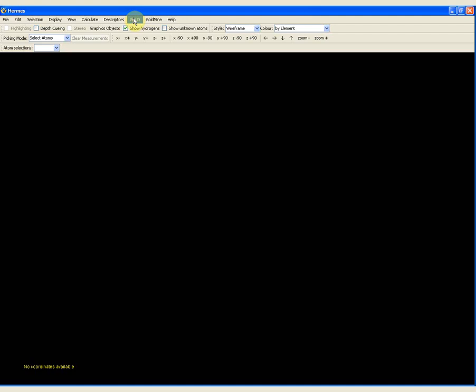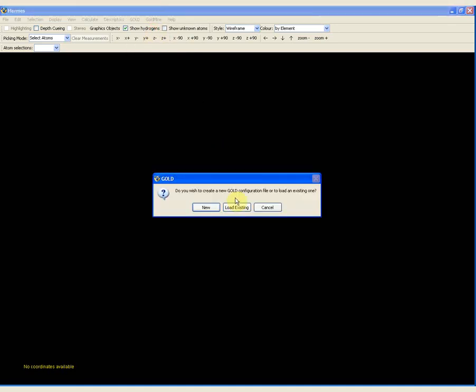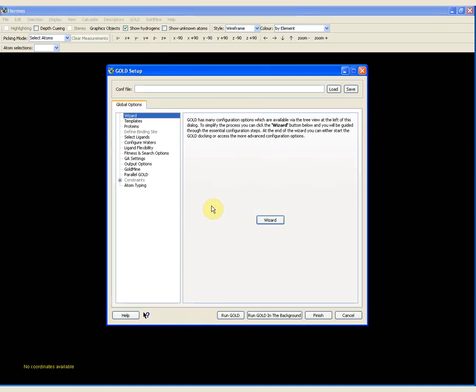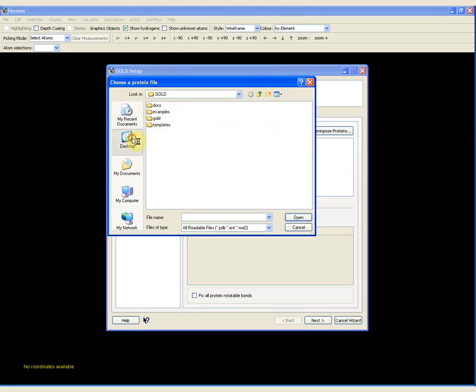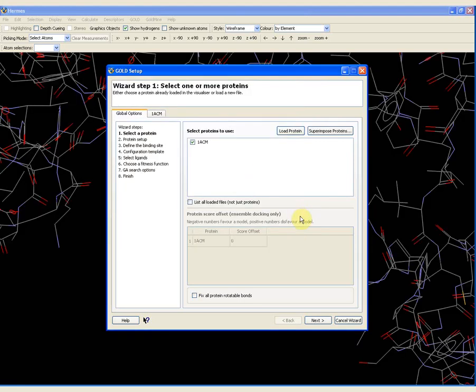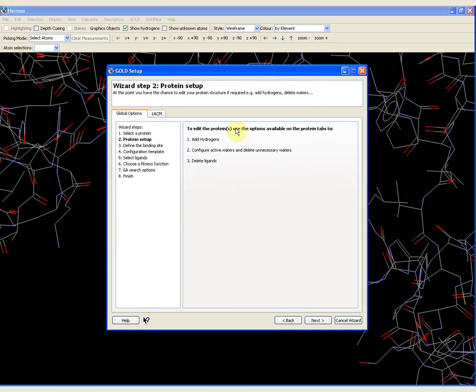Now I will do the demonstration. Having loaded up Hermes, you can access GOLD via the top-level menu where it says GOLD. Press on GOLD and we are going to set up and run a docking. We are going to create a new configuration file and use the wizard. In the first step, we have to select which protein we want to use, so we load the protein. I navigate to where I have saved the protein file — this is a PDB file, 1acm.pdb. I click open, then I press next.